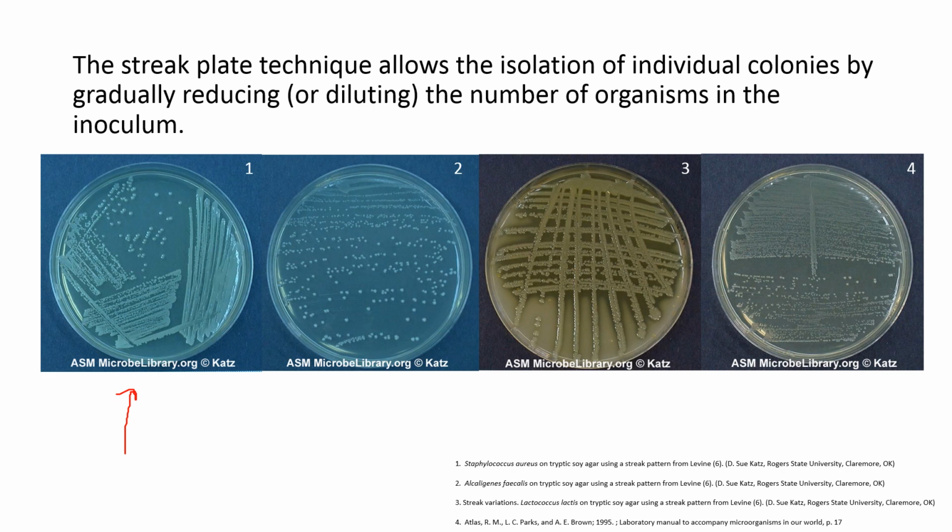So I'm going to describe this one, but I have these other plates here so you can see that the 4-quadrant technique is not the only technique. There are others. In the 4-quadrant technique, you would take an inoculum. Usually we wouldn't use a sterile cotton swab for this, but we'd use an inoculating loop. So we'd apply bacteria here at the very top of the plate, and then we'd spread that out with an inoculating loop, going back and forth from side to side, making streaks as close as we can to each other, but not going backwards. So we always go in one direction.